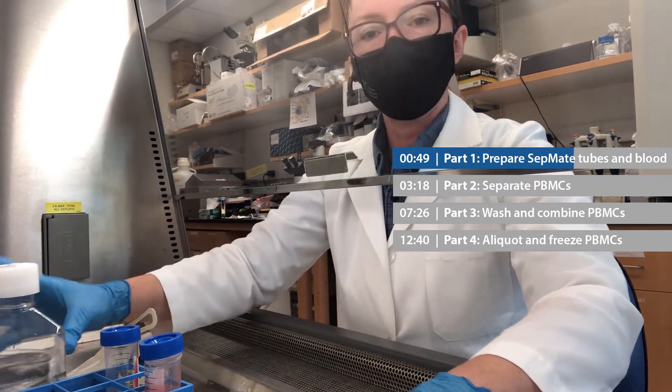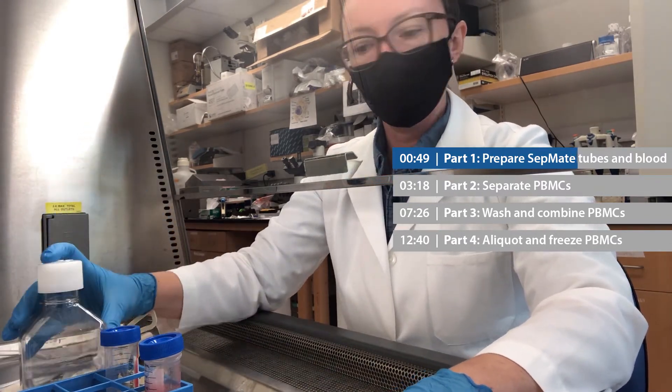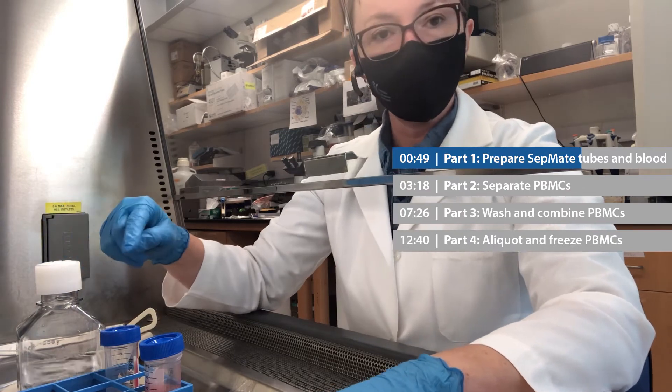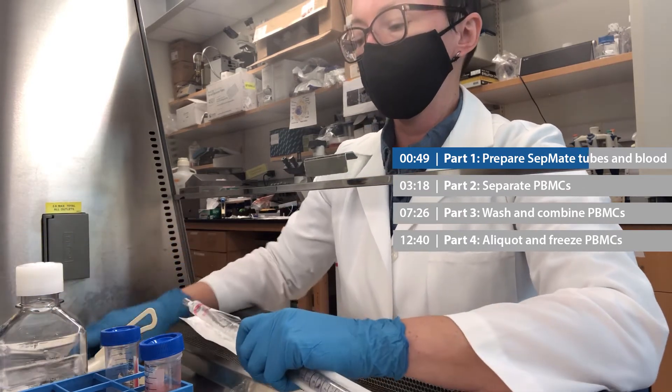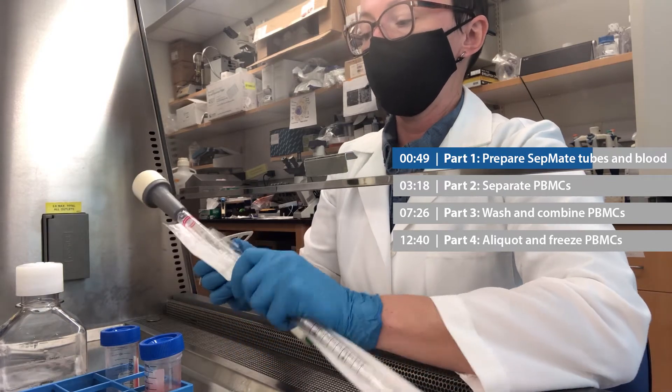Now I'm ready to dilute my blood with room temperature DPBS. I'm going to add an equal volume of DPBS to each tube of blood, so I'm going to add 20 mils of DPBS, and then I'm going to pipette up and down.